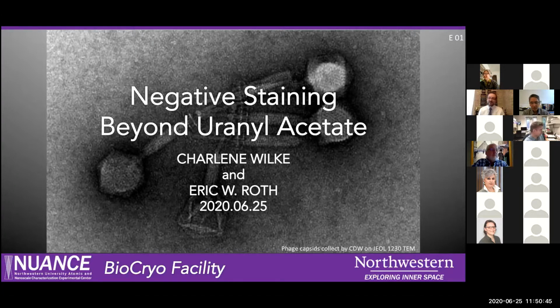True, Dieter. It is a very simple technique. If you're mixing up uranyl acetate, it saturates at 3%. And then you get precipitate, and if you let it sit for a while, even at 1%, sometimes it precipitates out after a while. So as far as what it's being dissolved in, this is also just what's available commercially. You buy your uranyl acetate powder, so you can't get it in the other forms very readily.